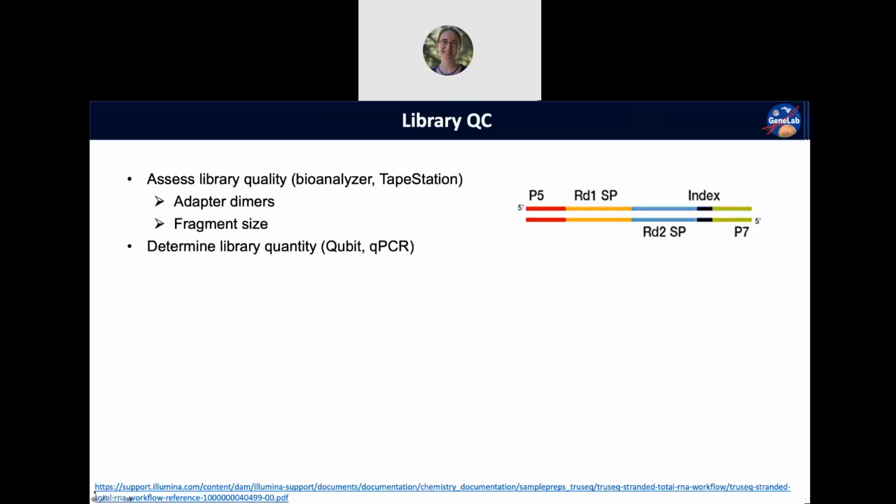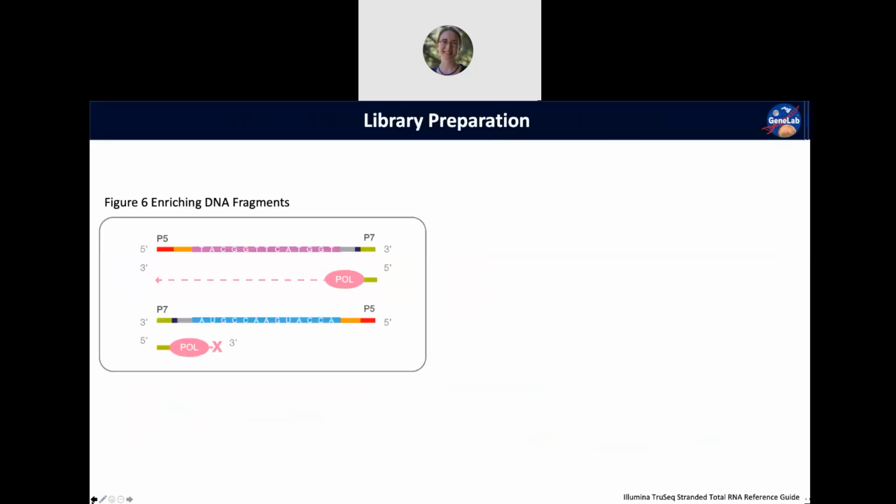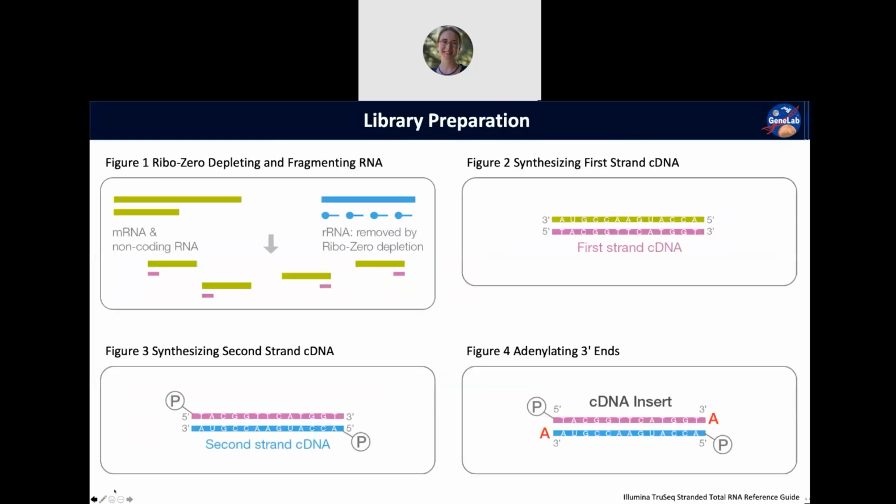Felix said what? What do you need to go over again? I'm happy to. What's the advantage of strandedness? Good question. So as we're going ahead and, I guess I'm gonna go here first. So as we're making this first strand synthesis, actually, no, I don't have this straight in my head right now. I used to know that answer, but I don't want to confuse you. So let me get that straight in my head again. And then tomorrow morning, I will talk to you first about why strandedness is important. Unless, Marie, do you know off the top of your head right now?